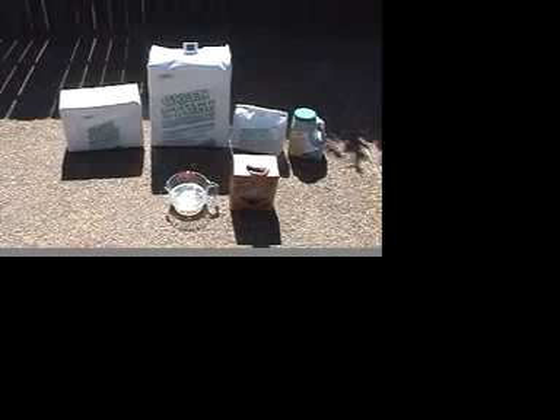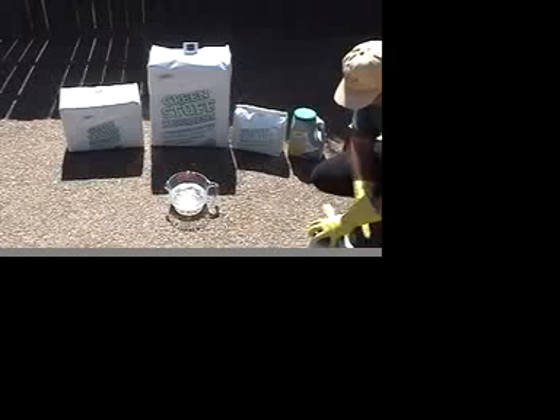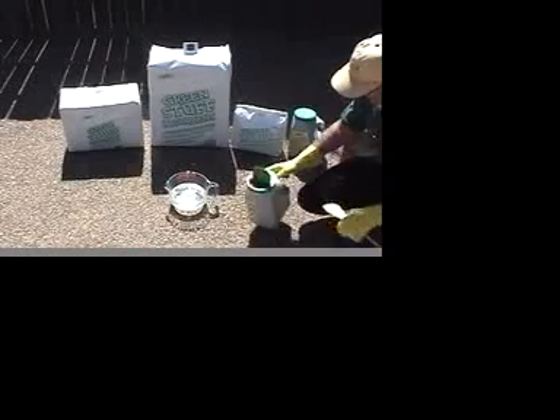We'll begin dropping some GreenStuff into it now. We're going to put approximately one half of a pound of GreenStuff in, and we'll observe its absorption rate.